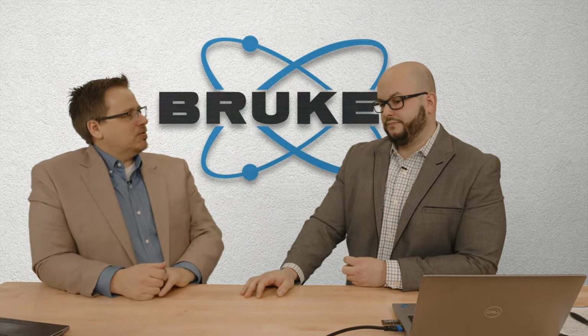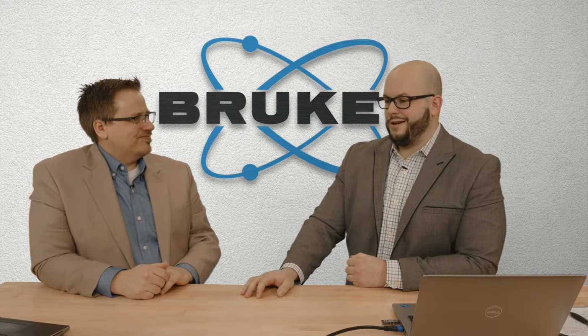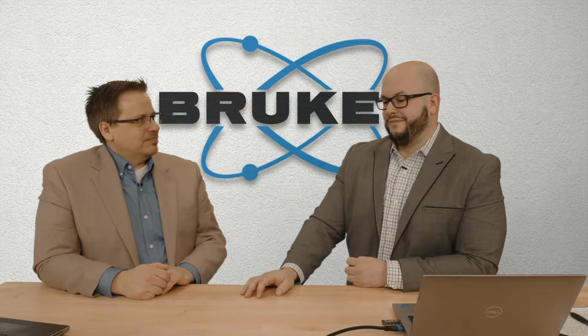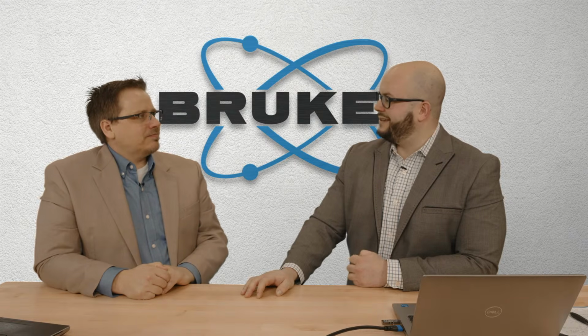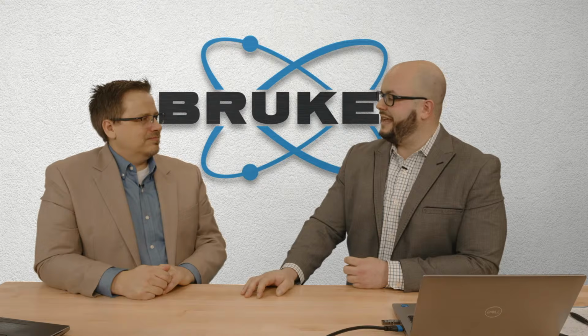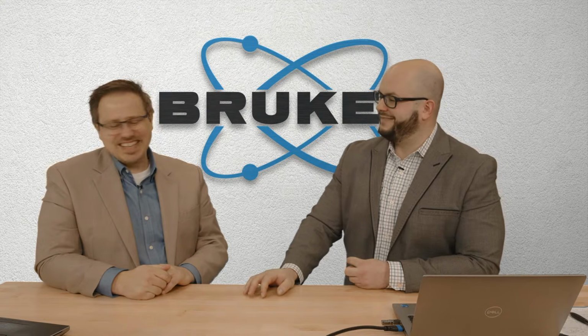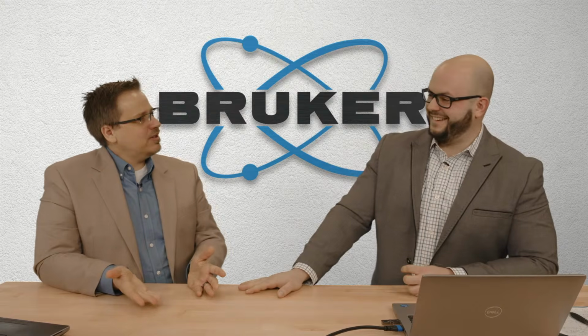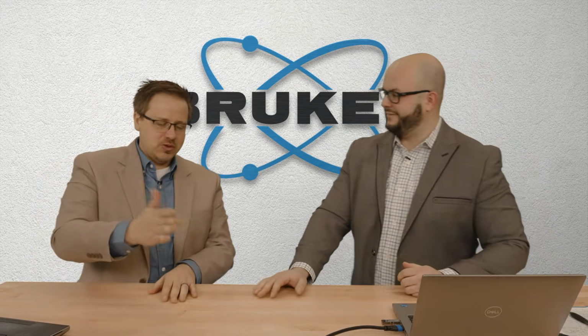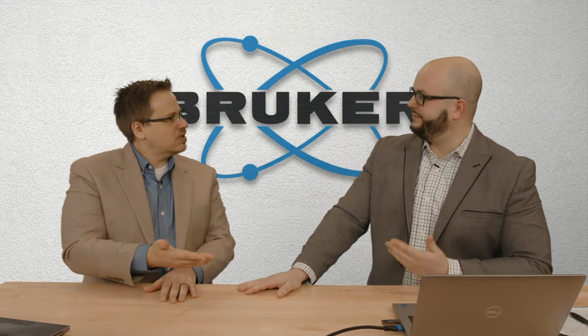So how long do you collect? That's a great question. It's going to depend on what source you're using. It's going to depend on a number of factors. I normally go by when the data does not look noisy. And the thing to think about too is it's not just when it does not look noisy in the one measurement, but you kind of want to do a quick measurement and see what your statistics look like.